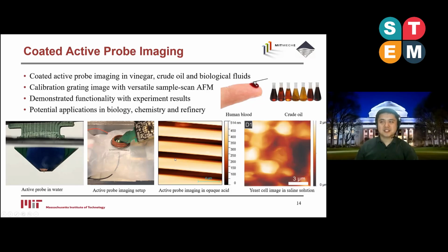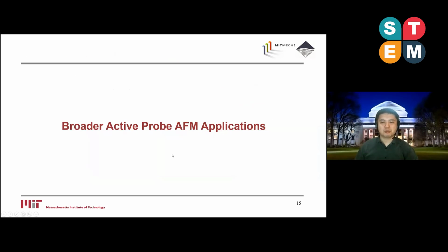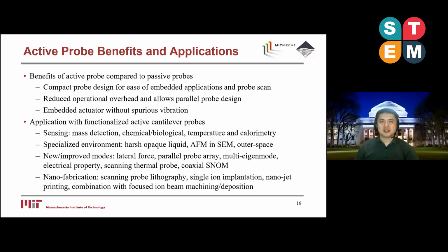All right, now that we've seen one example application, we want to discuss a bit more about the broader applications of active cantilever probes for various other applications. Compared to passive cantilever probes, active probes have several benefits.